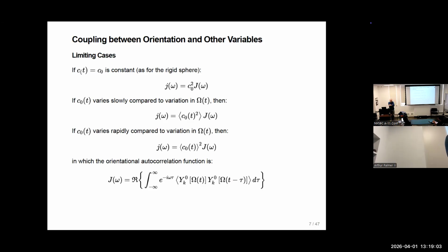That could be. I'm not sure that that's true, but yeah, Dennis told me that for reasons he couldn't remember, back in the original paper, they realized that there was this contribution from the off-axis motion of the hydrogen, but they didn't include it for reasons he couldn't remember.